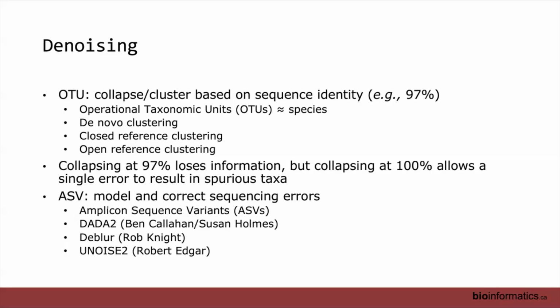And maybe it is in one special application, but often in practice, we don't find that there are actually that many differences. You might end up with slightly different numbers of ASVs at the end. Maybe if you're looking at the rare things, you will have some more differences there. But typically in the dominant taxa within the community, we don't really see differences regardless of which one you use.